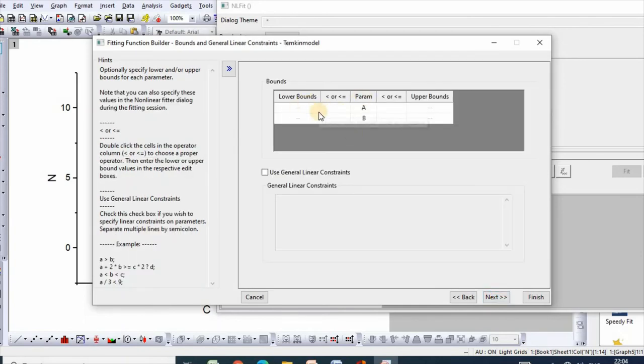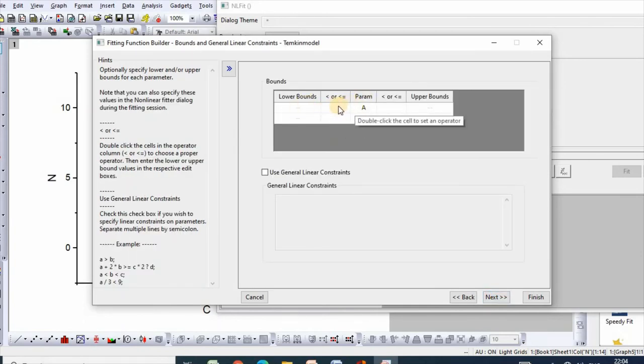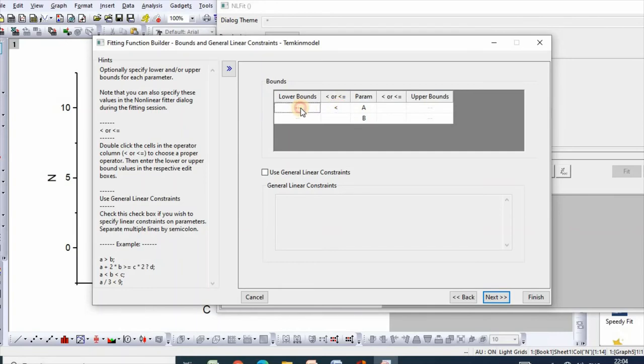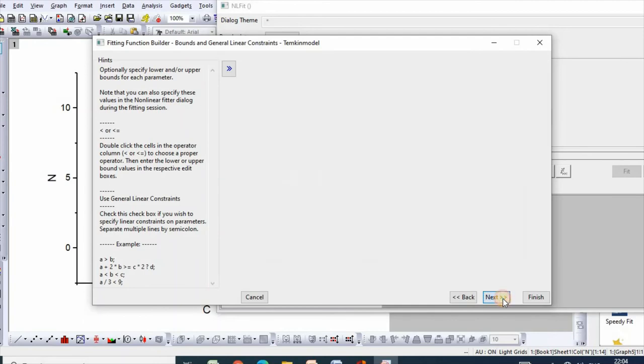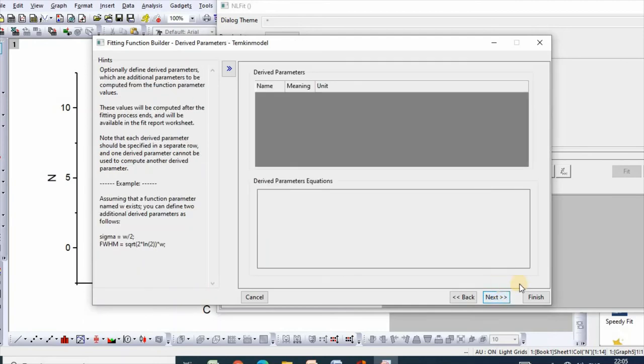You need to select bounds. Values of A should be greater than 0, so you need to make it 0. Similarly, values of B should be greater than 0. Then click Next.